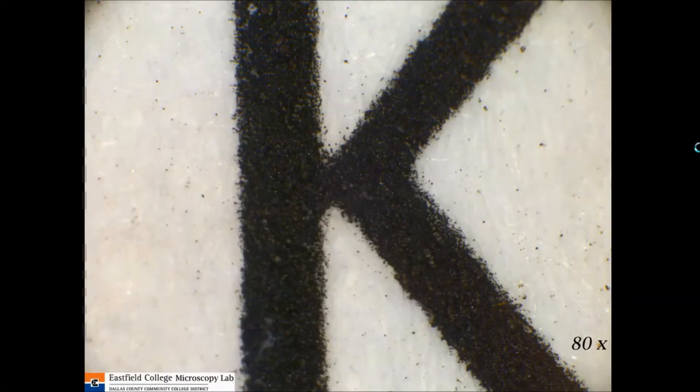Here is the same letter K at 80X magnification. Now you can really get the idea that what makes up this letter is actually a whole bunch of little specks of ink. You can even see that it spattered some places around here. We don't pay attention to that or don't see the little spatters because they're so small.